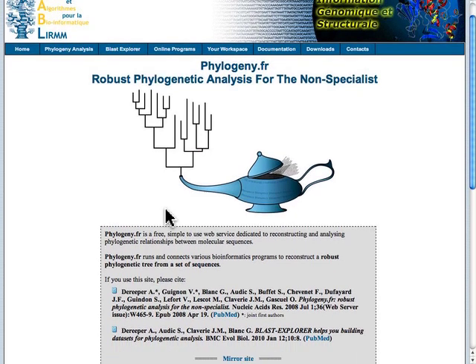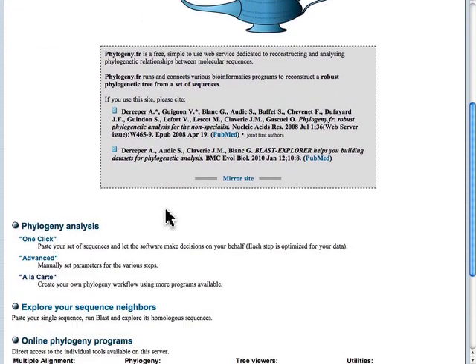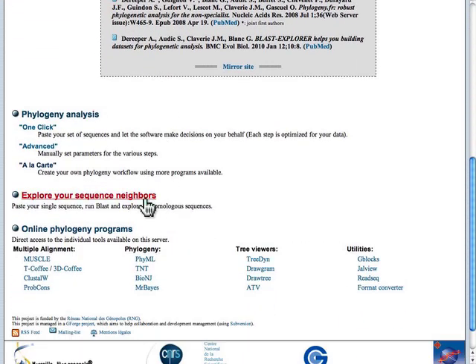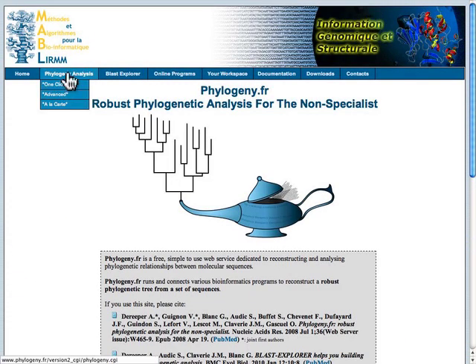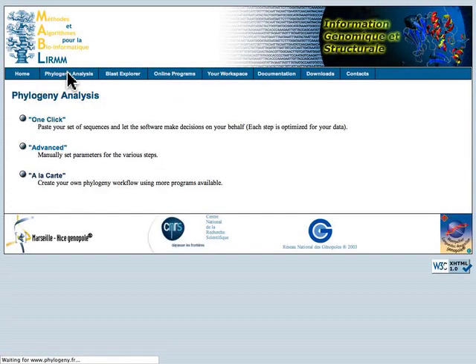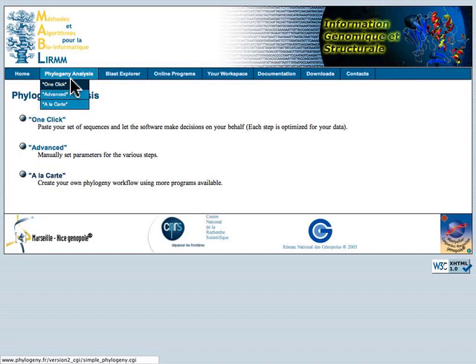We're looking specifically at the phylogenetic tools, so if you scroll down, you'll see some of the options here. I'm going to go back up to the main menu, just because it's the first thing you see, and click on phylogenetic analysis there.